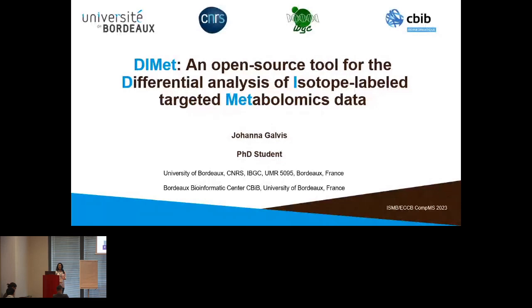And we have also examples that we furnish in Zenodo to understand the configuration and the data folder that needs to be organized in a specific way to perform our analysis. And the advantage is that we can keep trace of our parameters and the data that was used with this way of working.